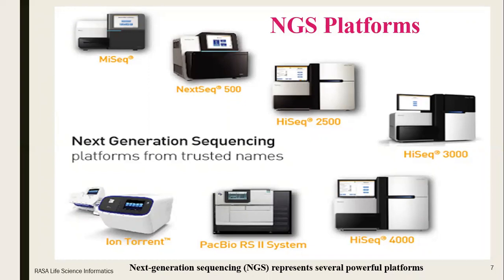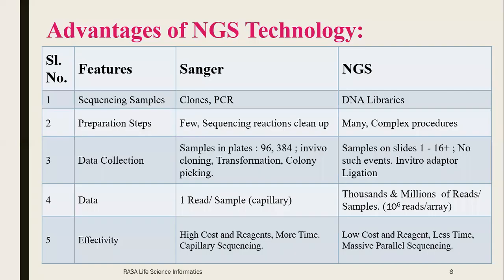Now, the differences between all these NGS platforms are based on read length, reads per run, accuracy, and runtime. And cost effectiveness also plays a role for each platform. Each platform has its own advantages and disadvantages, and so different researchers make their choice accordingly, deciding which platform to use.